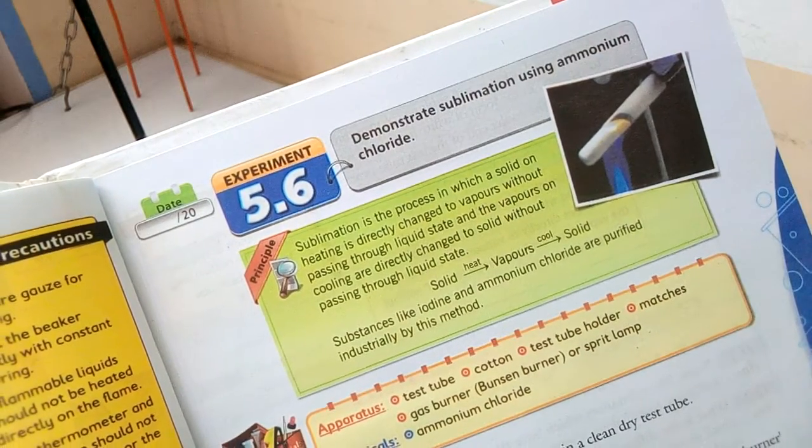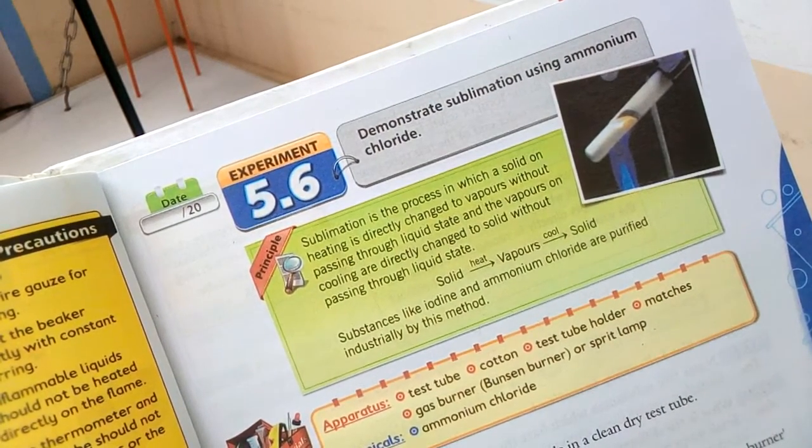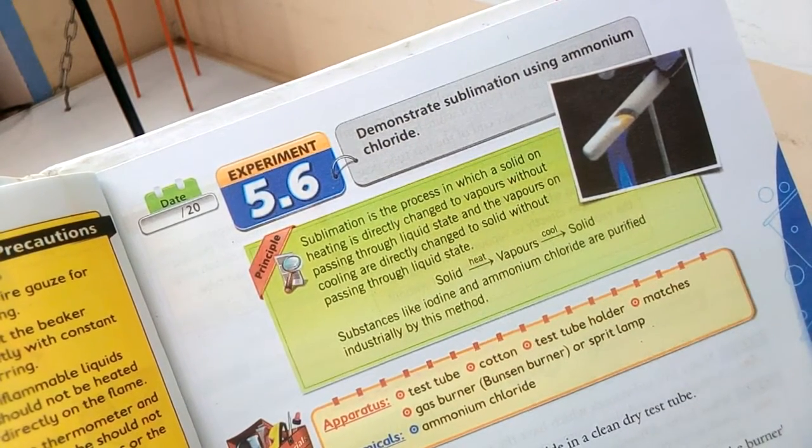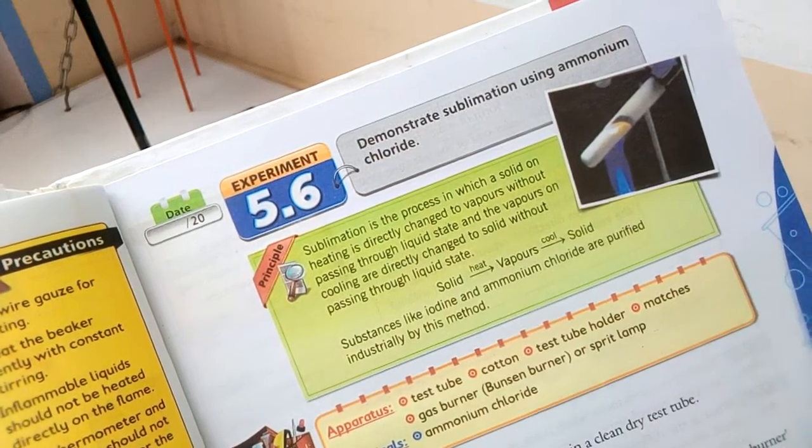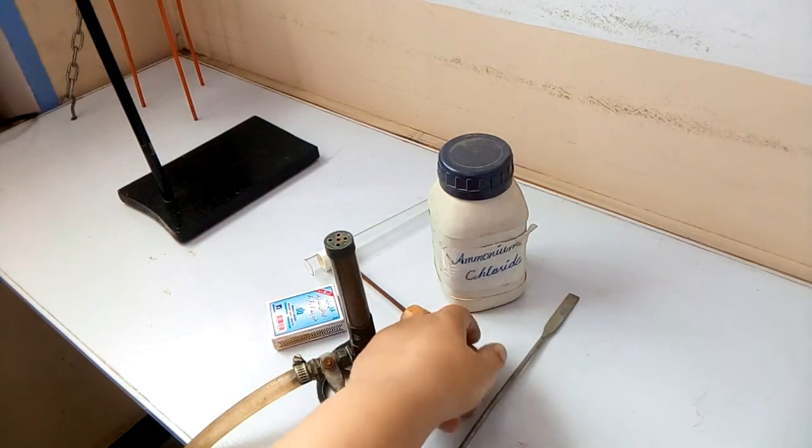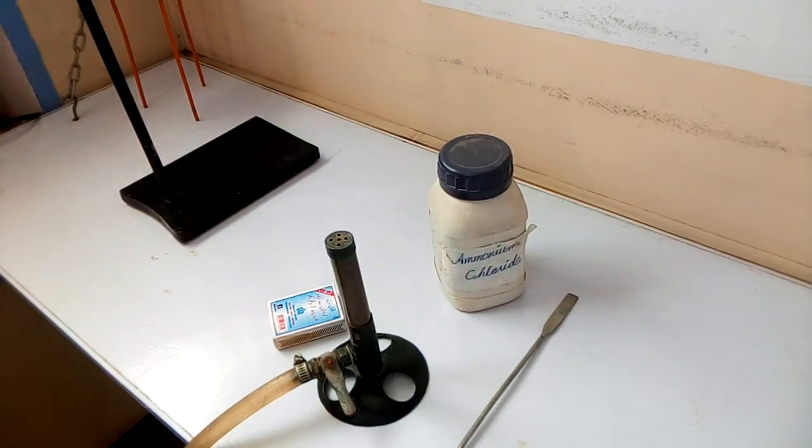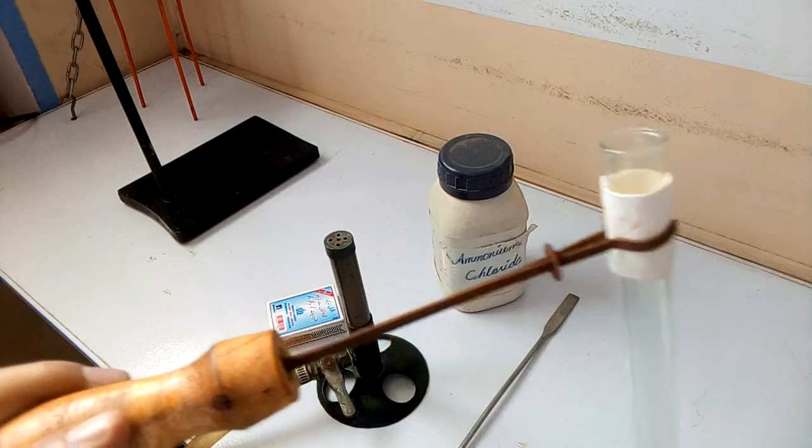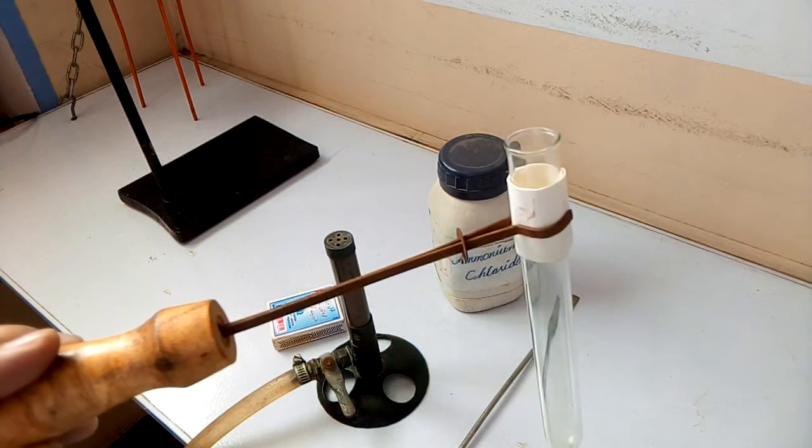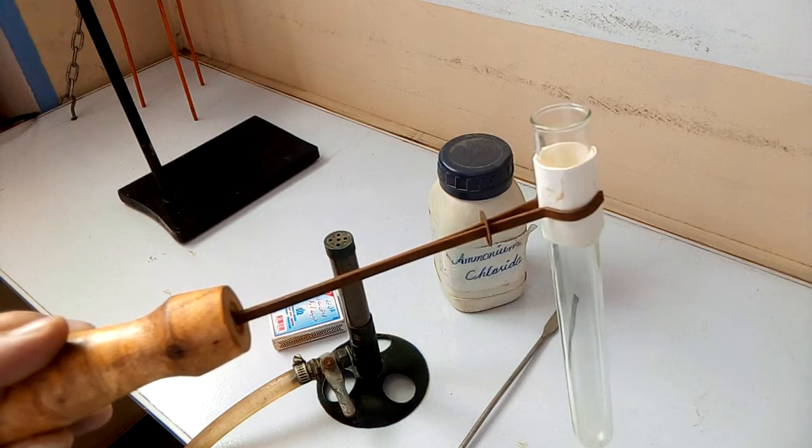The apparatus that we require for the experiment can be seen on the page. The apparatus which we need is a test tube. We have wrapped a wet filter paper along the side of the test tube and fixed the test tube in the test tube holder.